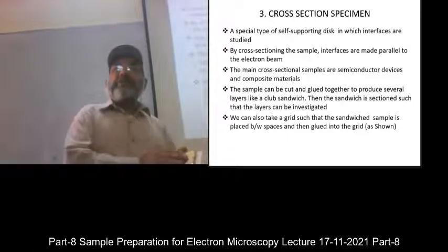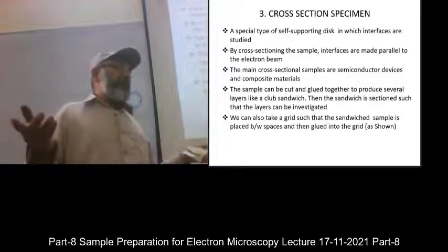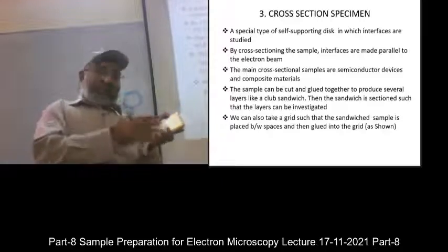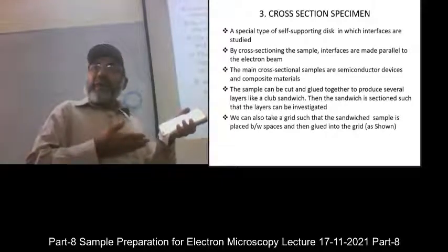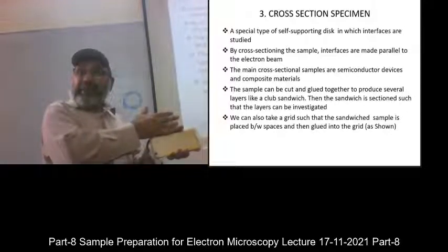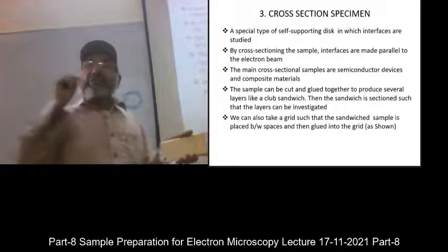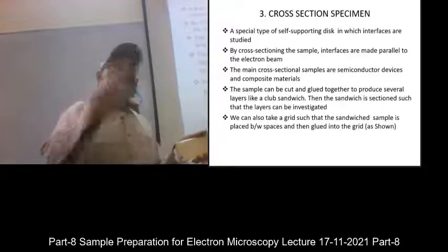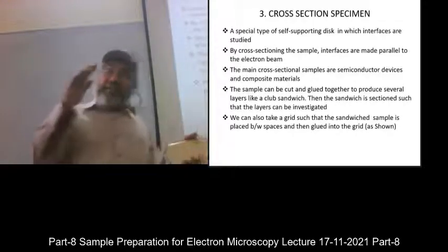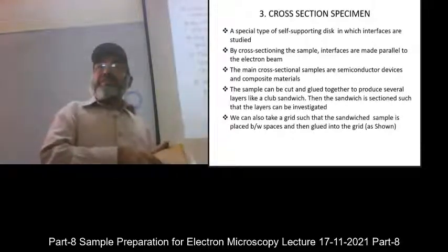They deposit gold particles, silver particles upon a material, then they heat it, then they take cross sections of those and look into the deposited layer and the bulk of the material, and what the infused or diffused ion did with the base matrix. So when you are studying that sort of material, then you need those cross-sectional studies.